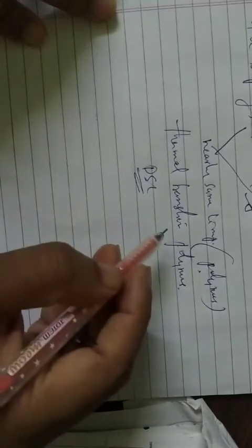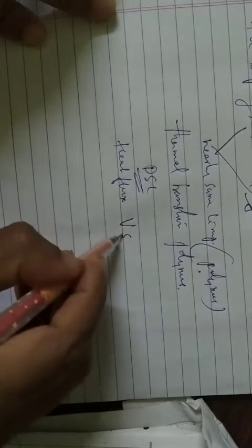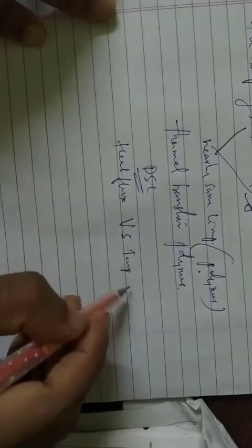The result of a DSC experiment is a curve of heat flux versus temperature or time.